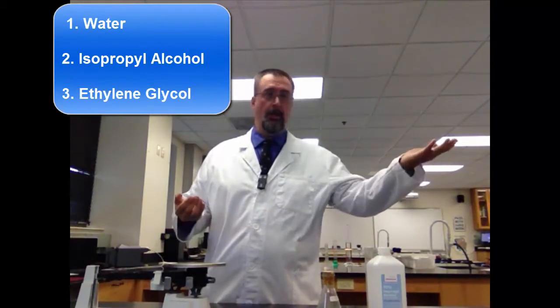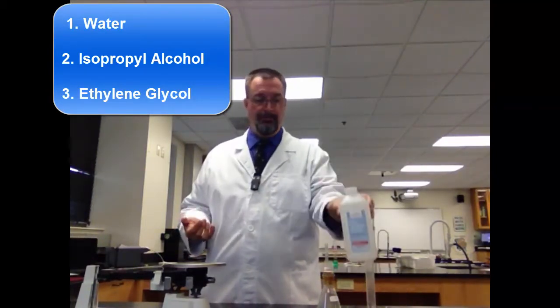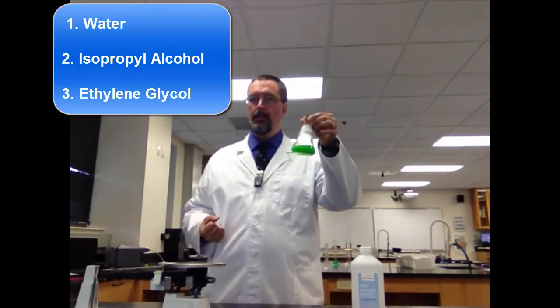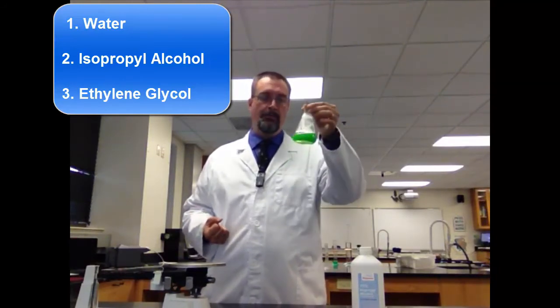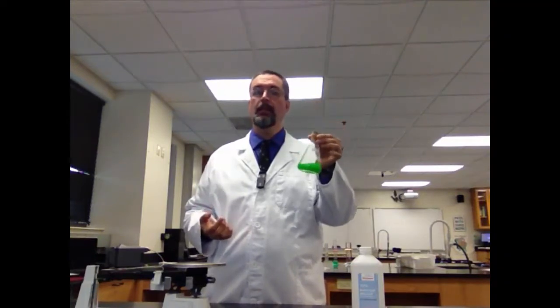So the liquids we'll be using are water, just out of the sink, isopropyl alcohol, this is just rubbing alcohol, and this tasty green liquid, which is called ethylene glycol. Now, the green color is actually from some other impurities that are in here, but mostly it's ethylene glycol.